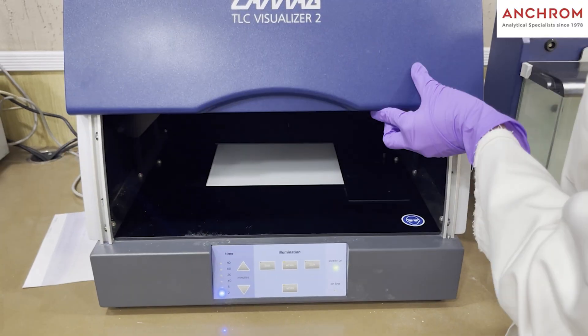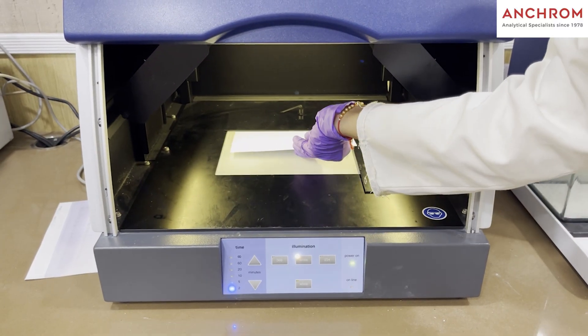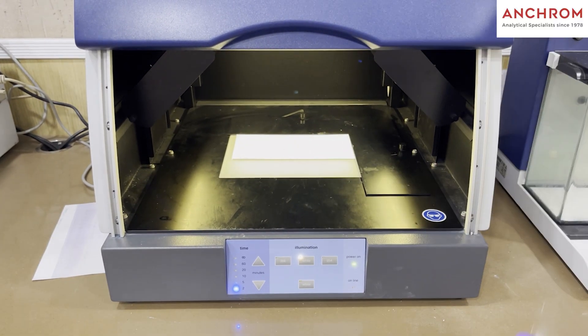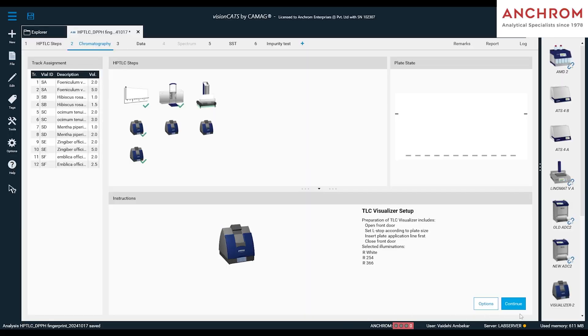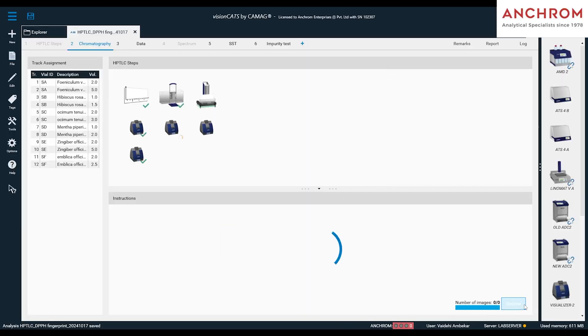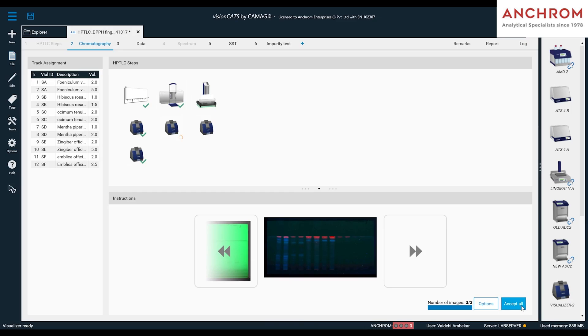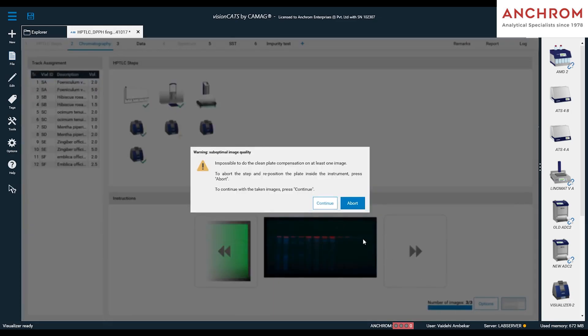Now, we will place the plate in the Visualizer 2 as shown. Then, click on continue to capture the images. Once done, click on accept.